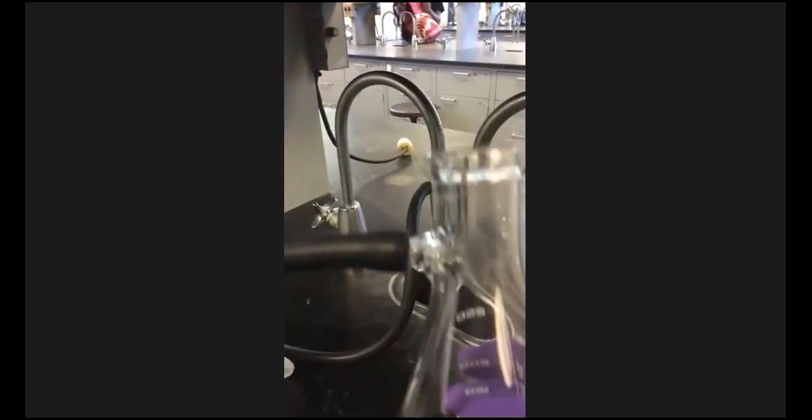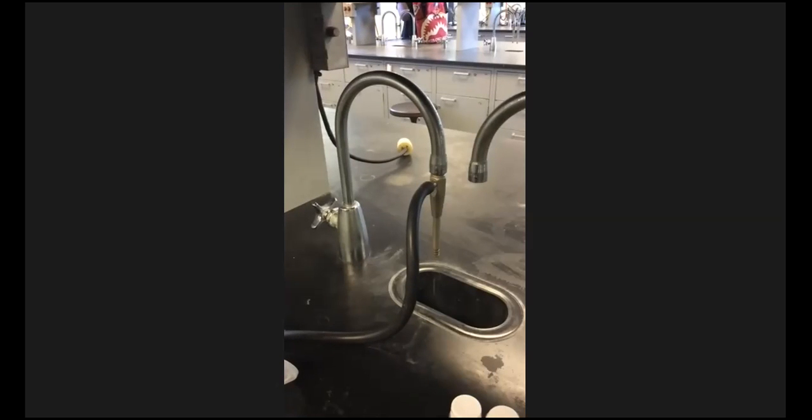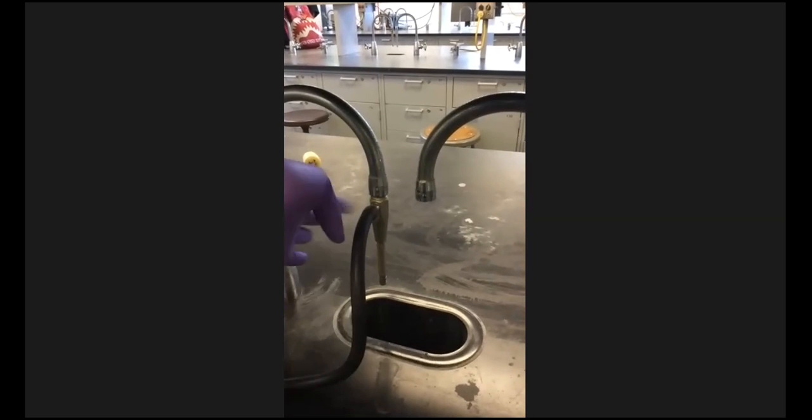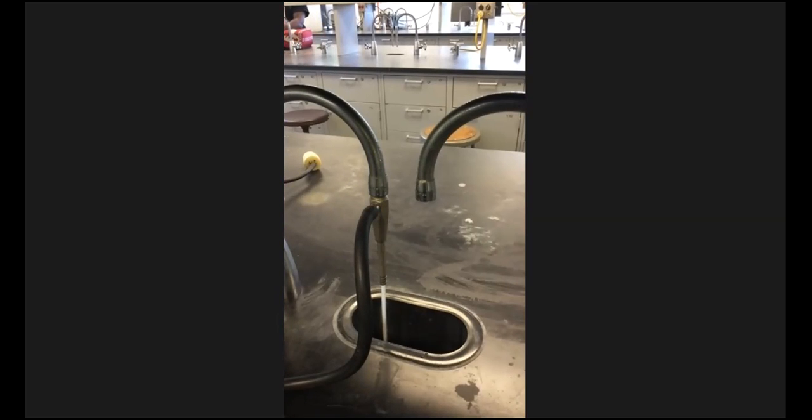And it's hooked up to an aspirator on the sink. Can y'all see that? So there's also a nipple on this thing here, and you just hook the hose up to that. When you turn the water on, the water going past the hose is pulling vacuum, right?